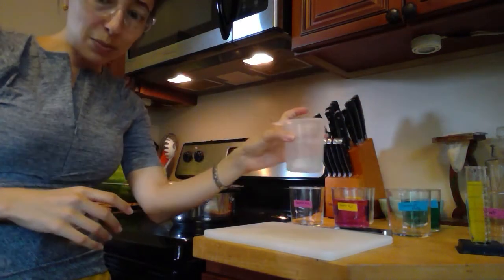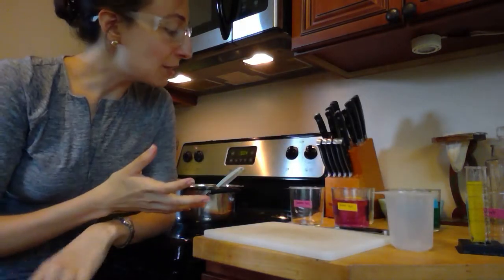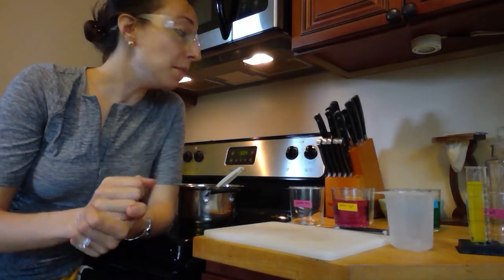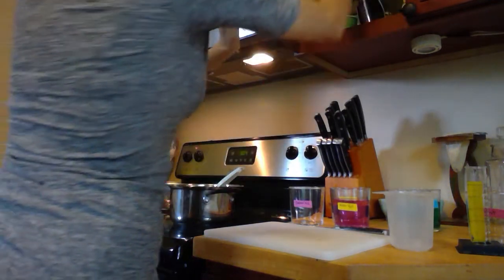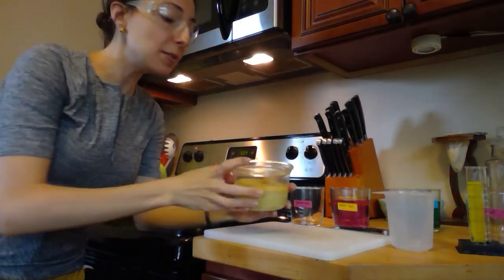I'm going to make sure to rinse my beaker out again between everything that I do. Now the next ones I'm going to get started are cashew milk and coconut milk. I've never tested the pH of those, so why not? And then I'm going to do some tea and some yeast. Now the yeast I have is actually a powder. It's called nutritional yeast, and I like to eat it on a lot of things.